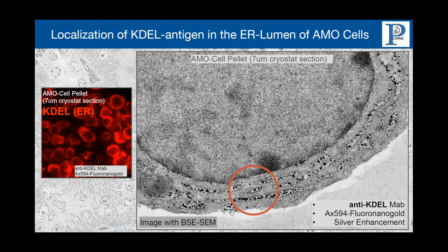Okay. Maybe a short comment. A very important advantage of doing wide field backscatter electron microscopy on glass slides is that you really do not need high contrast protocols. You can literally take an old historic block that was prepared for standard TEM with normal amounts of en bloc uranyl acetate and normal amounts of osmium. You do not need any high contrast staining protocol.